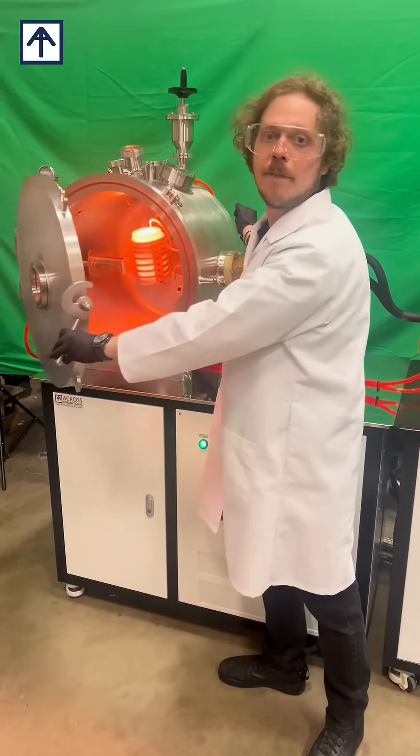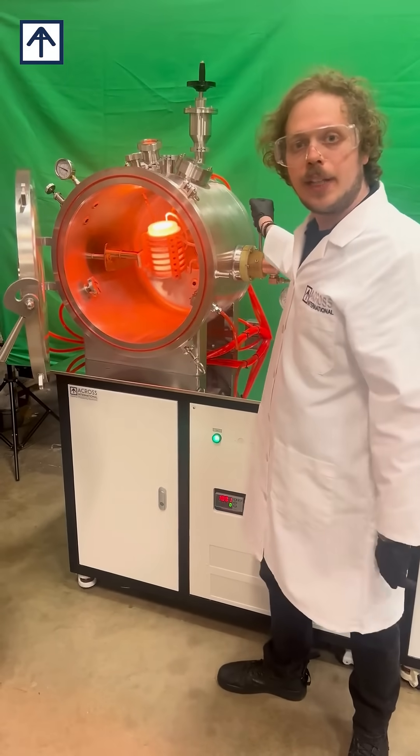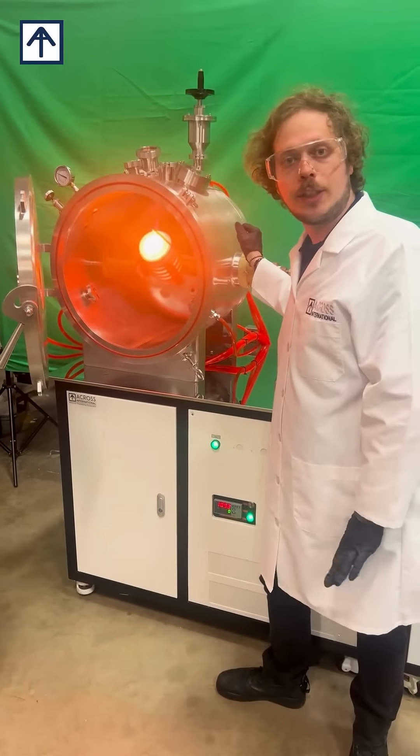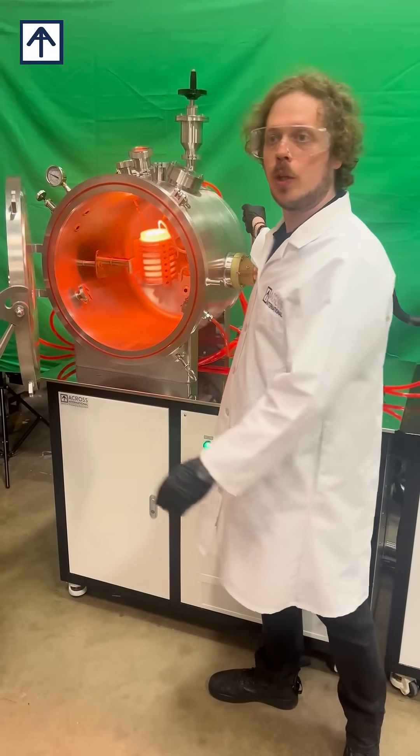This furnace uses a graphite crucible and may also use tungsten and other materials to heat up to 1,800 Celsius with our thermocouple, or up to 2,100 Celsius with a contactless pyrometer to detect temperature with our temperature controller.